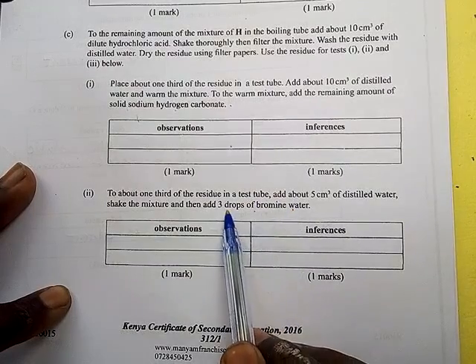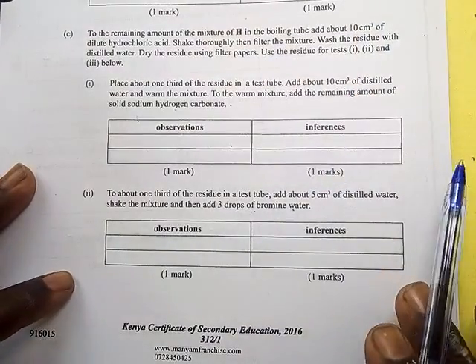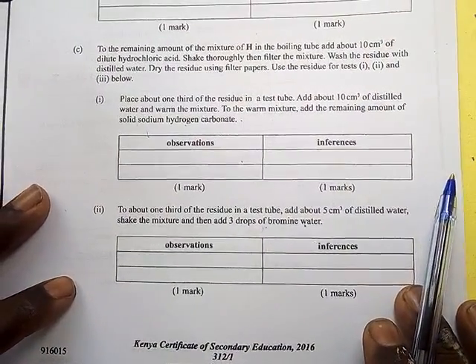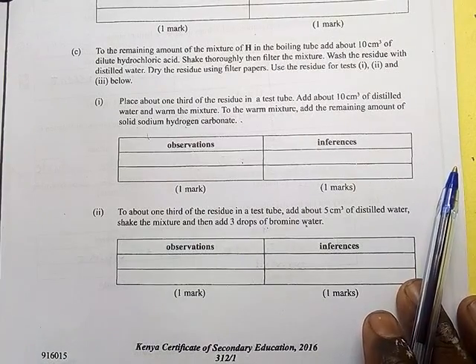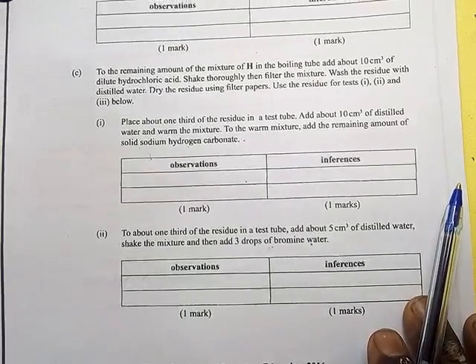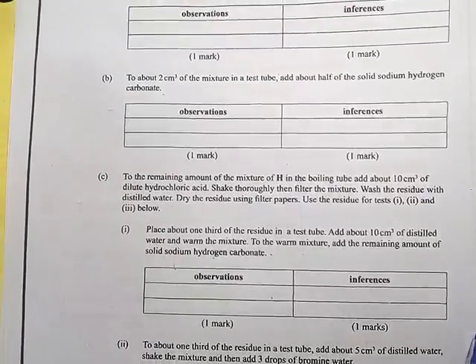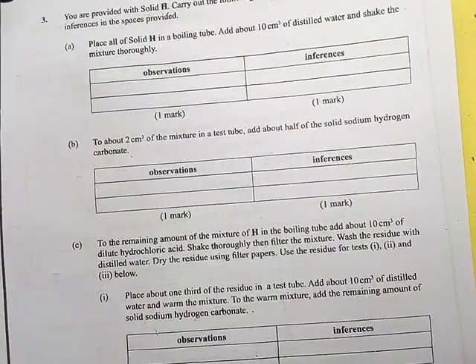So you see we have bromine water. That simply tells you that this compound we are dealing with is organic chemistry, or organic qualitative analysis. Therefore, you don't have to make a mistake of writing cations and anions in organic chemistry. You need to know that. So let us start from number 3 there.